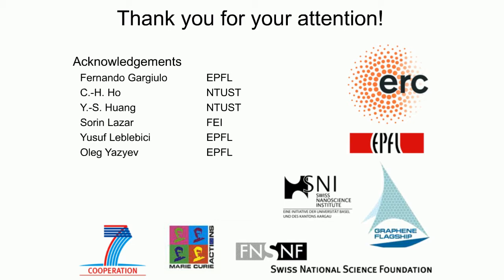And then on top of that, once you've gotten past that, you start to move to the instrument itself. What we find is that having a short lever, small spots and a short lever, reduces the thermal noise and therefore gives you better imaging. And then designing the instrument to avoid noise, in other words, making all the active resonances in the system above your operating bandwidth, and using a modulated laser source helps as well. I don't know if Andras had anything to add. No, nothing really. Okay.